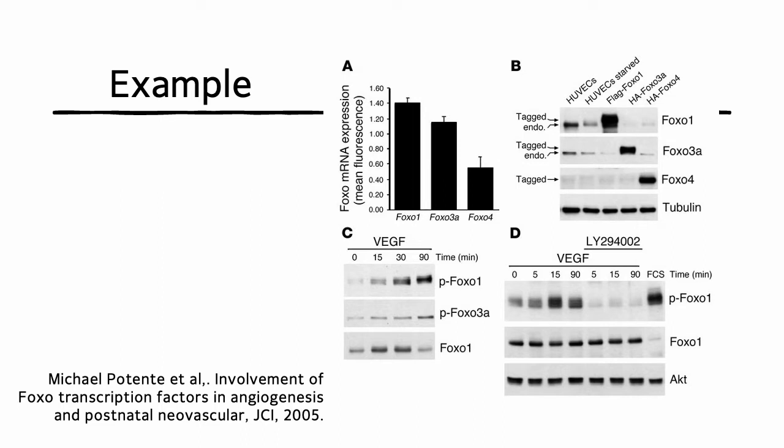You can compare the quantity of protein with Western blot, and also you can detect the phospho form of the protein. You can see the amount of FOXO1 here. However, you can see also the amount of phosphoFOXO1 here.